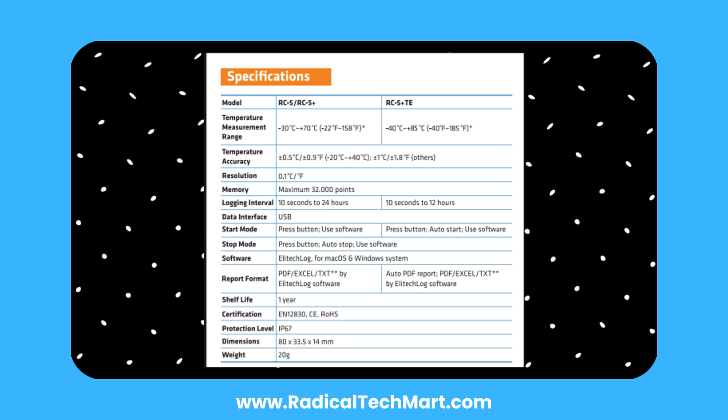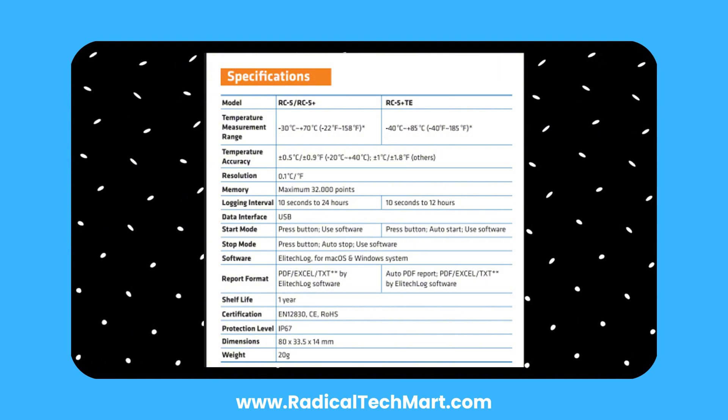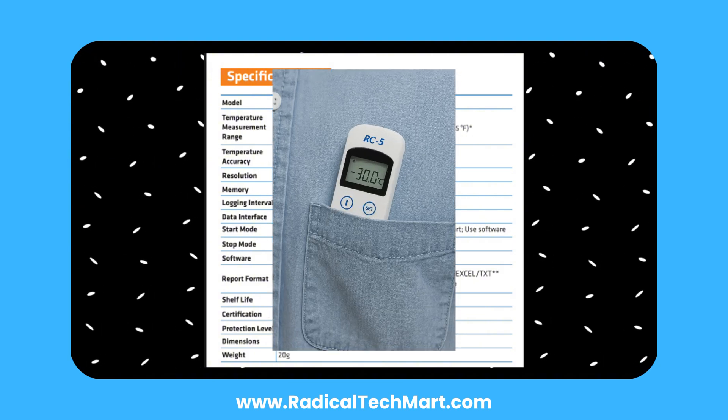The RC5 Plus also features an audio alarm and external probe. And yes, it fits right into your pocket.